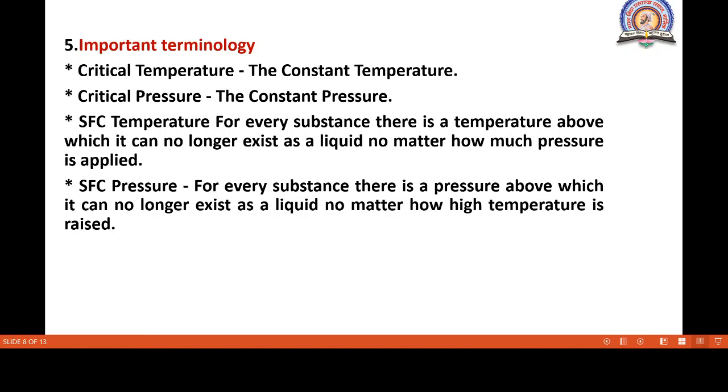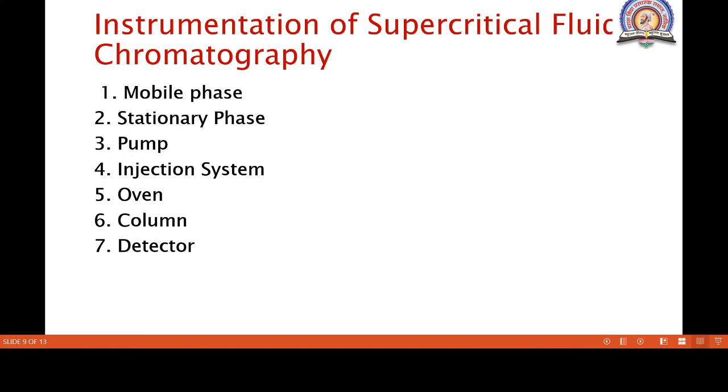SFC temperature: for every substance there is a temperature above which it can no longer exist as a liquid, no matter how much pressure is applied. SFC pressure: for every substance there is a pressure above which it can no longer coexist as a liquid, no matter how high the temperature is raised.